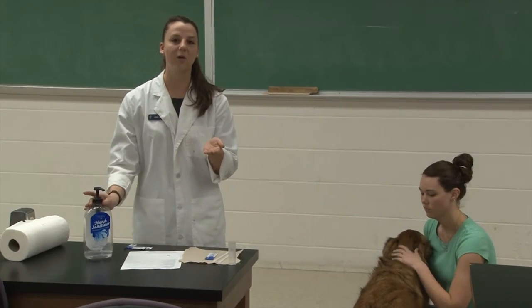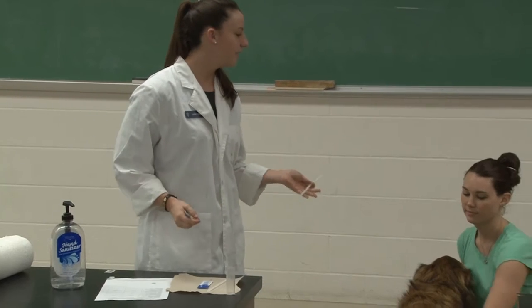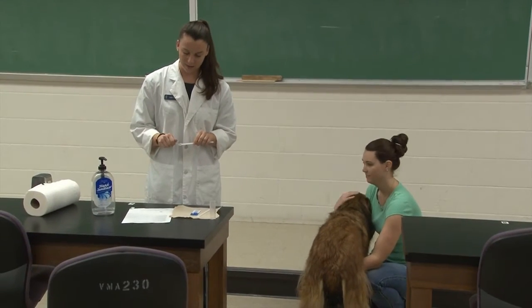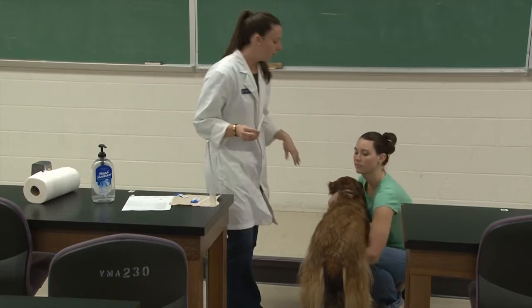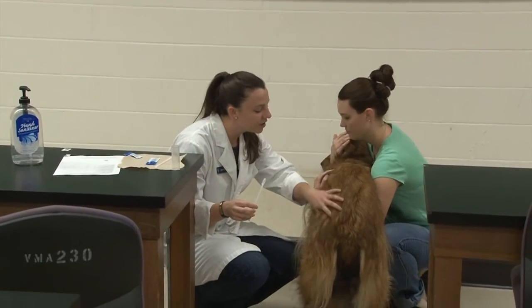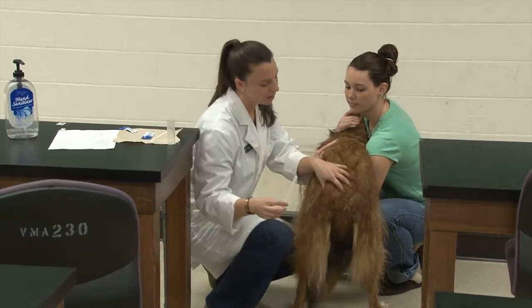Before I start I always sanitize my hands, make sure that they're nice and clean, and then I'm going to make sure that Z is restrained. Lindsay today is my helper restraining Z. I'll lube up my loop, and then I'm going to talk very nicely to Z to make sure he's not anxious or nervous. You want to make sure he's very comfortable and knows that I'm back here.